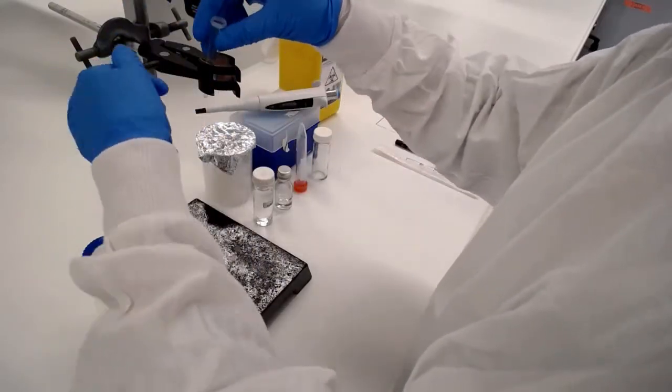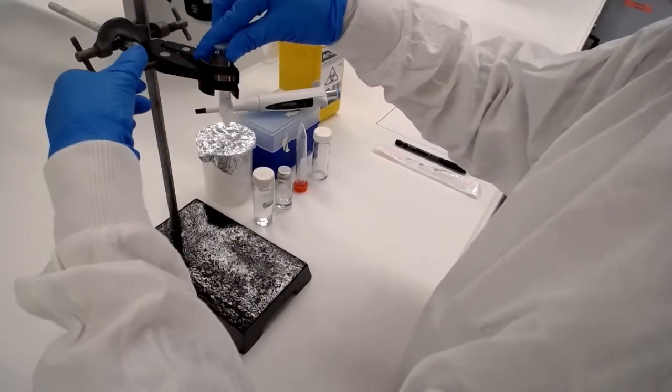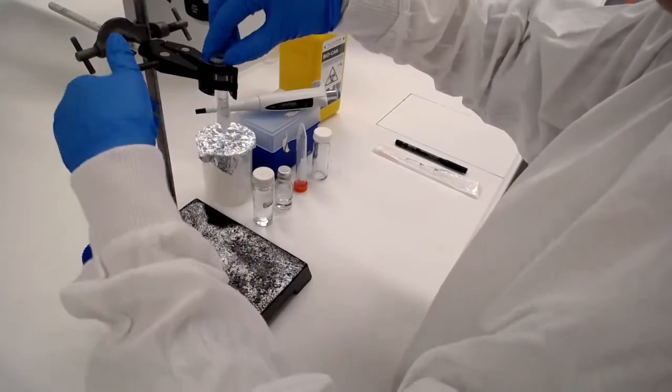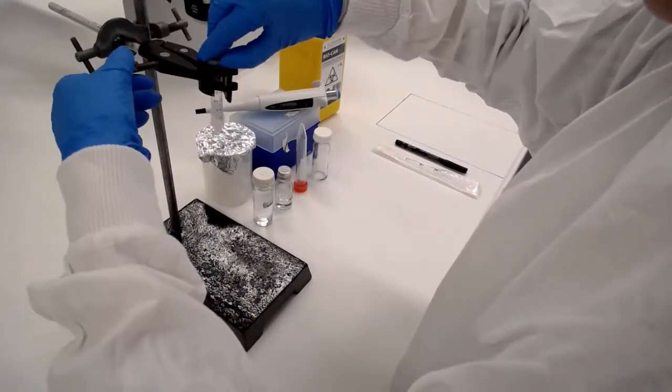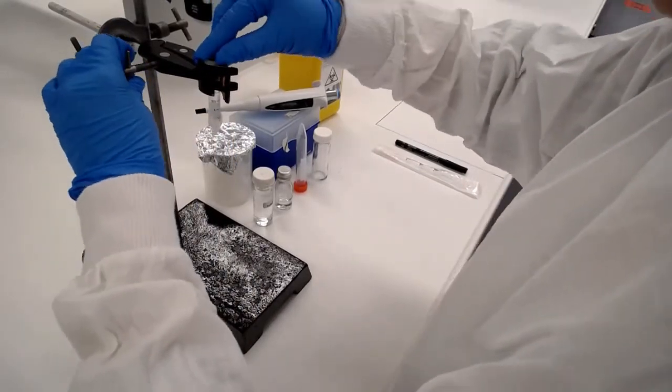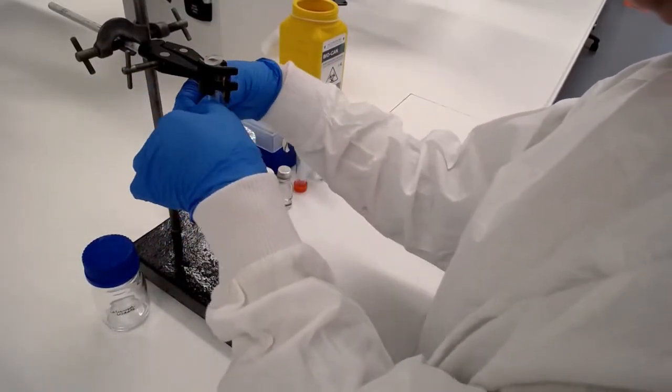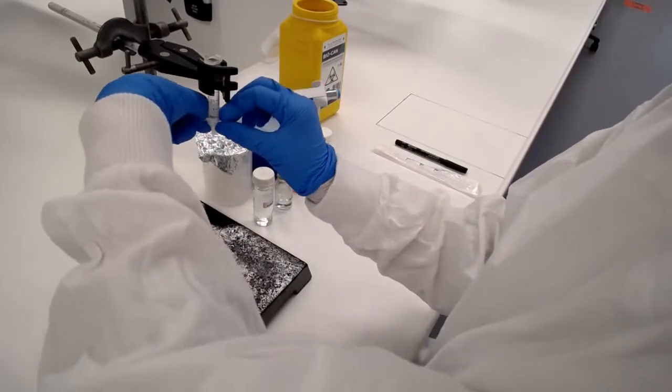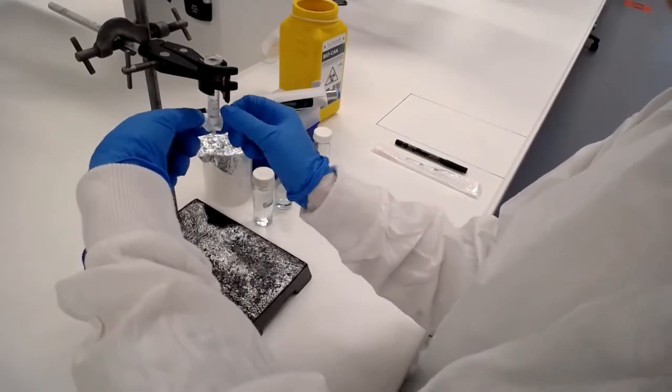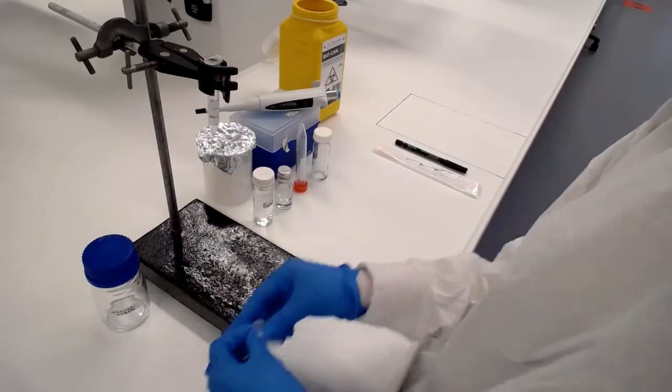First, we set up our column. The column is just a syringe barrel with some nickel agarose in there, which you can see has a blue color, then some cotton wool at the bottom, and it's covered by parafilm at both ends just to keep the column moist. We need to take that parafilm off before we do anything else.